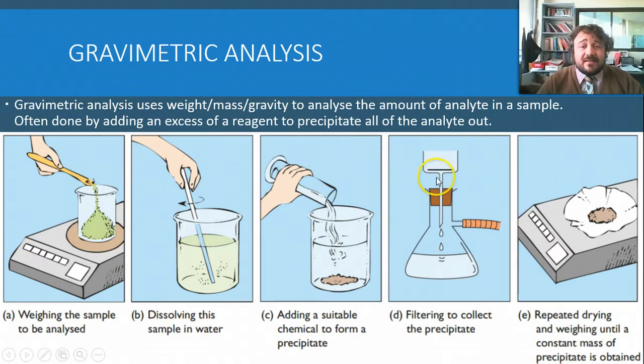This is called a sinter filter. It creates a vacuum here, so you can see it off top. There's a water hose running there, which pulls all the air out and pulls it through here, creates a vacuum, and it's not a big deal. So that's our funnel. We've got our filter paper in there, and we just suck it out.